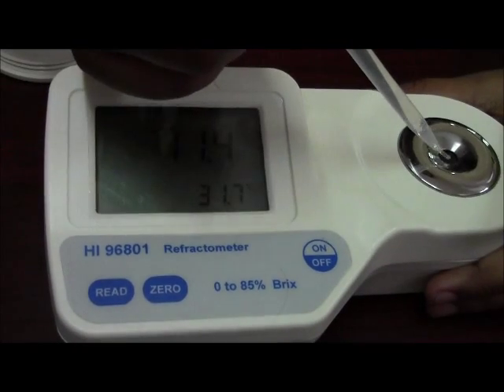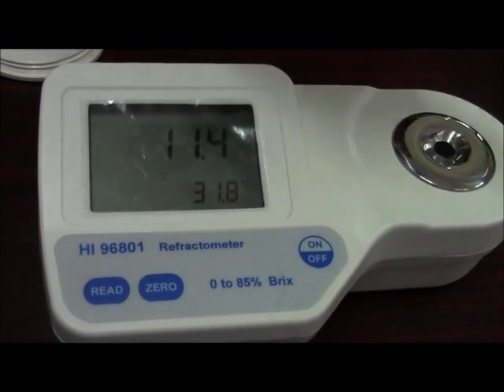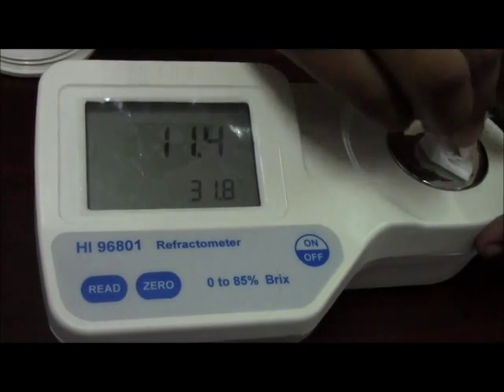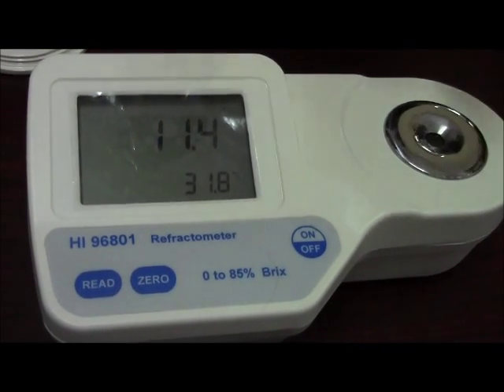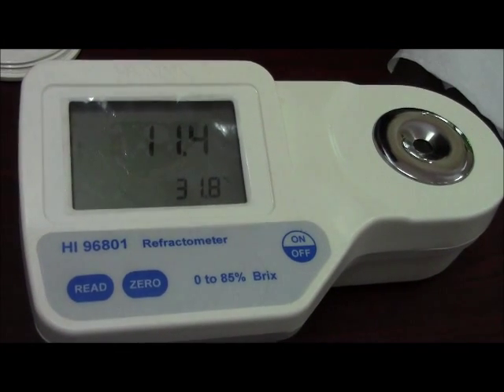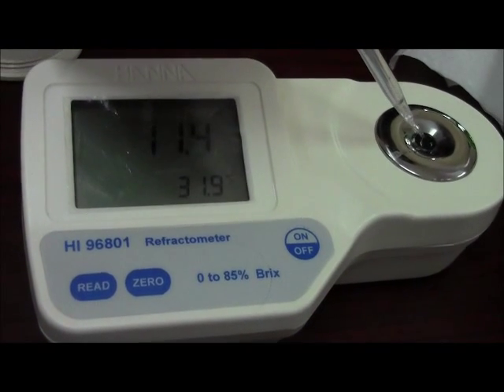Rinse it with distilled water. Again, zero the meter using a few drops of distilled water.